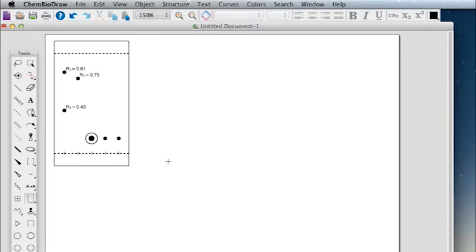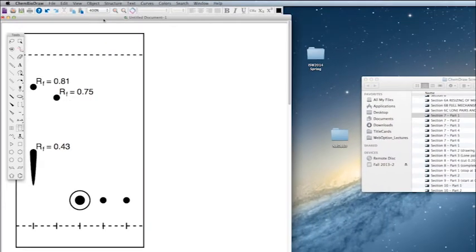To show a streak spot, place your cursor over the desired spot, then press and hold the Shift key. By doing this, your cursor should now have turned into resizing arrows. Use the down portion of the resizing arrow to drag the spot down to the desired length. You can also use similar steps to resize the spot's width. This can be a slightly difficult task because the dot can be small, so magnify the area if needed. It is important to mention that representing the streak does not change the RF value. Remember, you will still need to identify the samples for each lane.